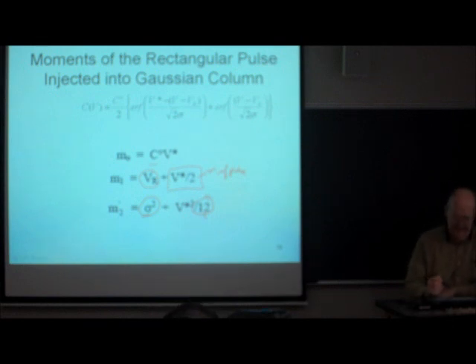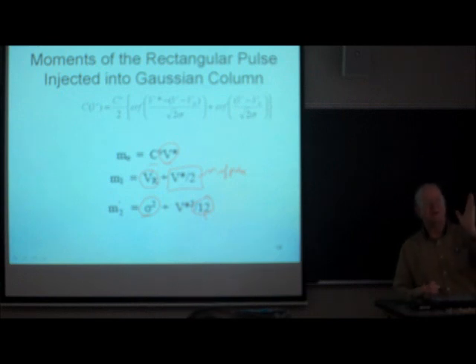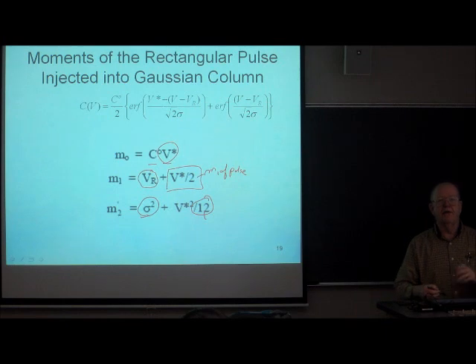So, what have we learned? If I increase this, my area gets bigger. You saw that when I drew all the curves. If you increase the injection volume, V star, the peaks get wider.